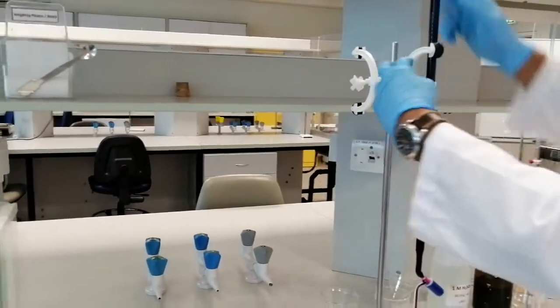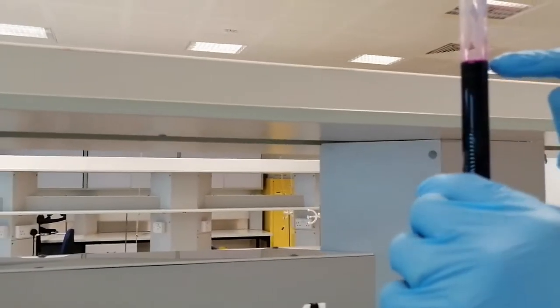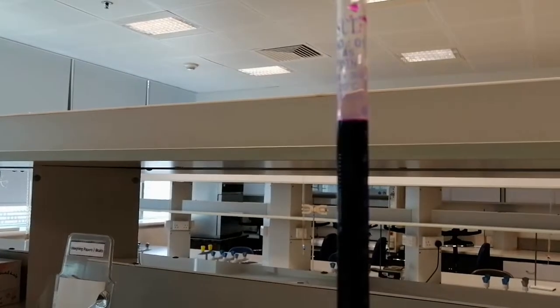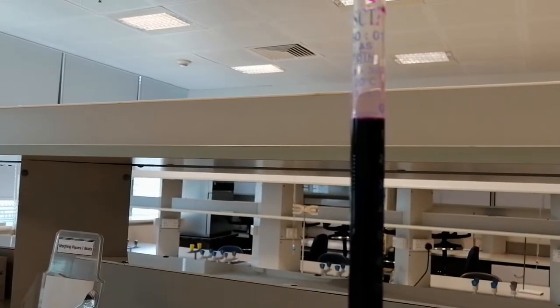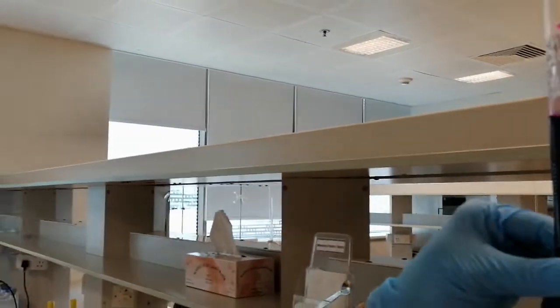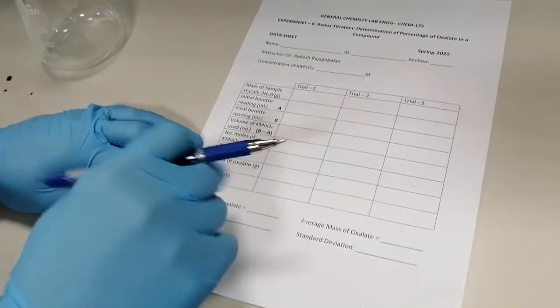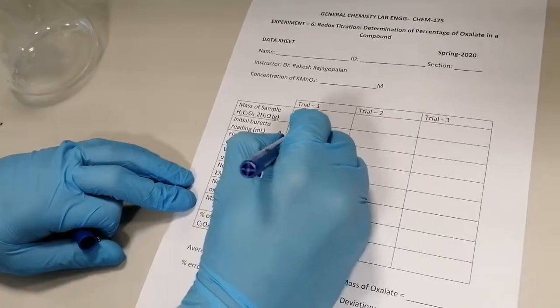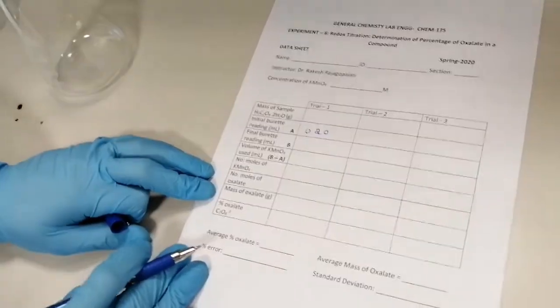Looking at the top of the burette — I've kept the meniscus, the upper meniscus, at around 0.20. Remember that potassium permanganate solution has a deep purple color and is not transparent. That's why we use the upper meniscus rather than the lower meniscus for the reading. So the initial burette reading for the first trial is 0.20 milliliters.